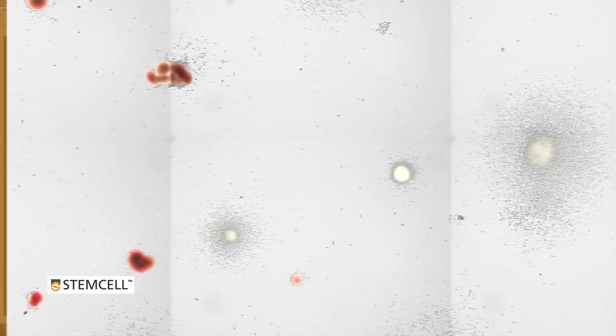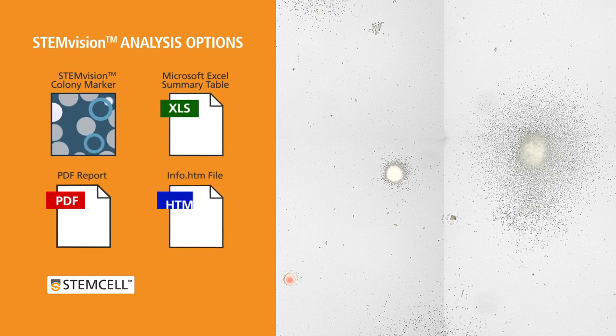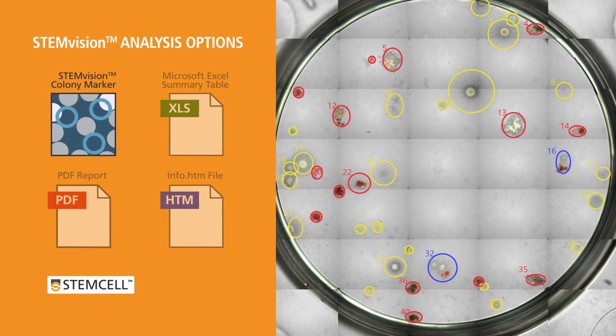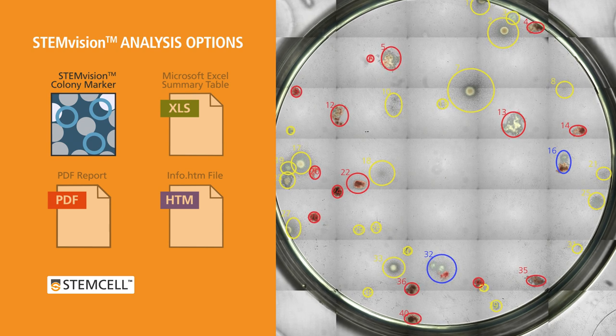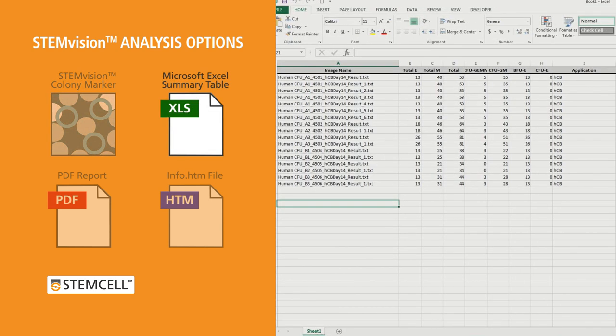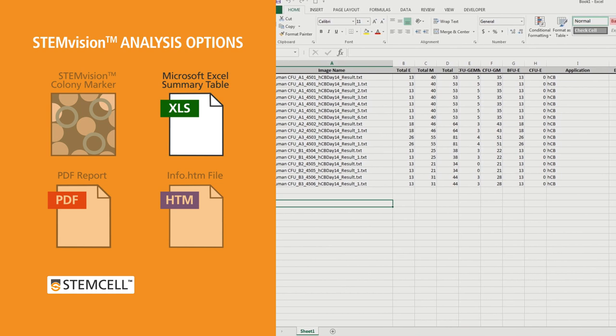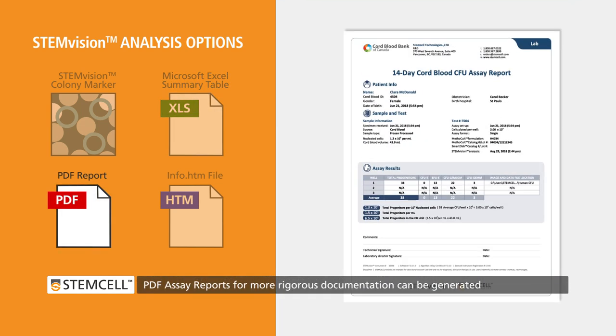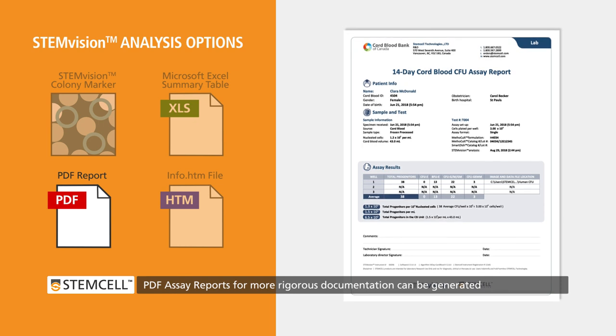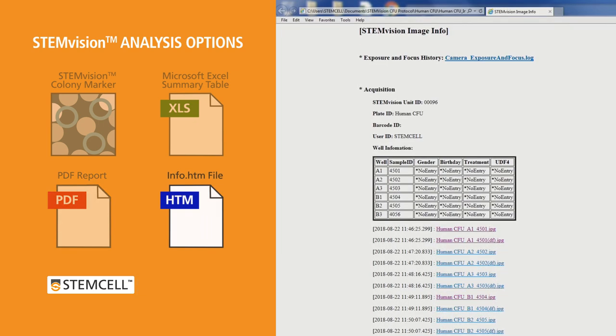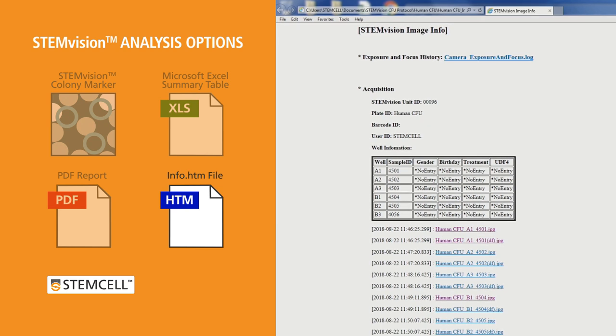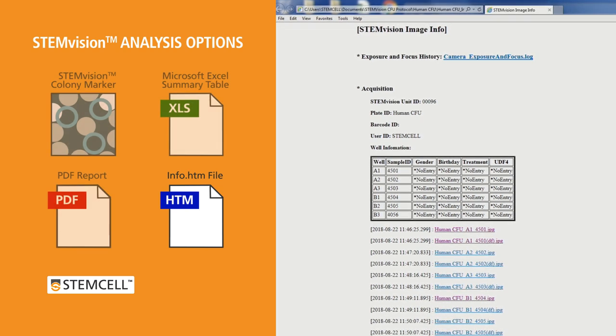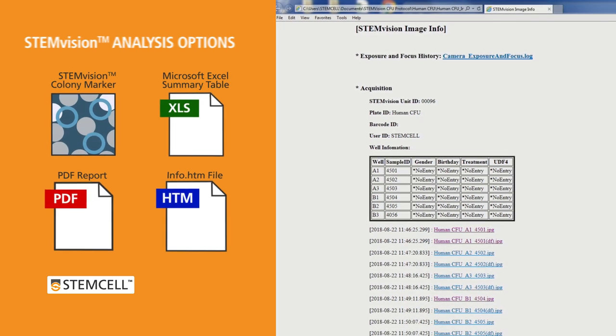Results from automated STEM Vision analyses can be viewed in several ways. The STEM Vision Colony Marker application can be used to view images of individual wells. Or Microsoft Excel can be used to import a summary table of colony counts. For CFU assays of human samples, printed assay report forms suitable for more rigorous documentation can be generated. Furthermore, detailed results for individual images can be viewed in the analysis result files saved in the image folder.